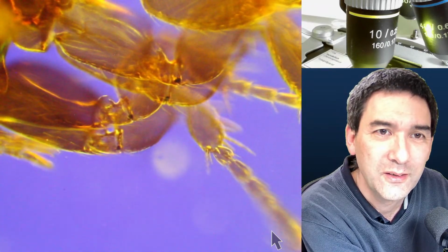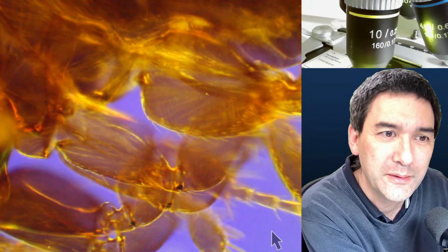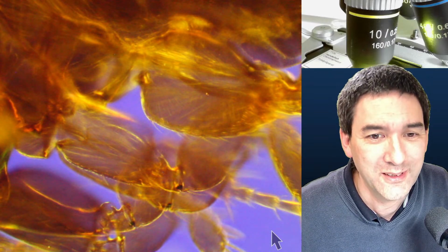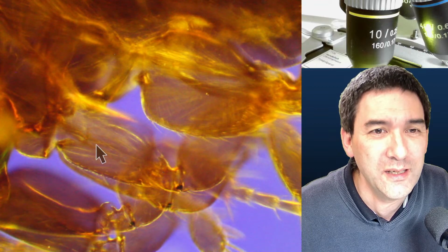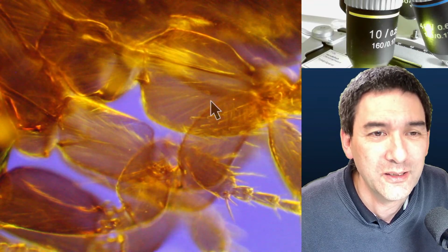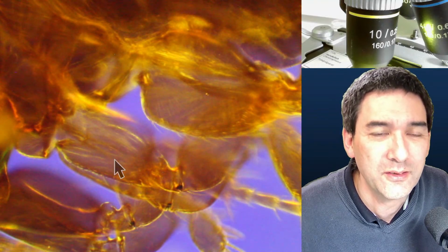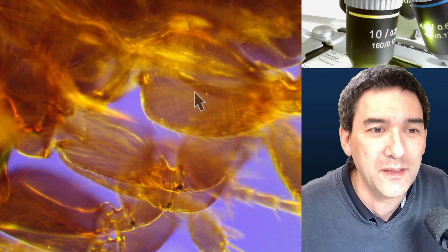Because we're looking here at a whole mount, let me show you a little bit of biology as well. Look, here's the arrow. Do you see inside the legs those structures? Those lines here, and also over here. These are muscles inside the insect.